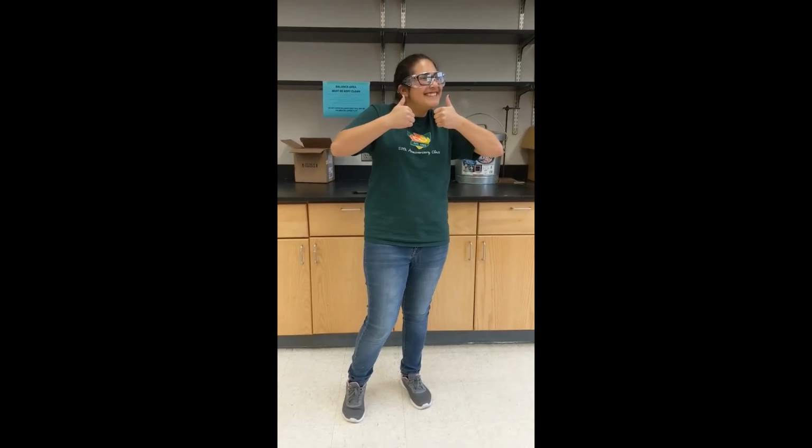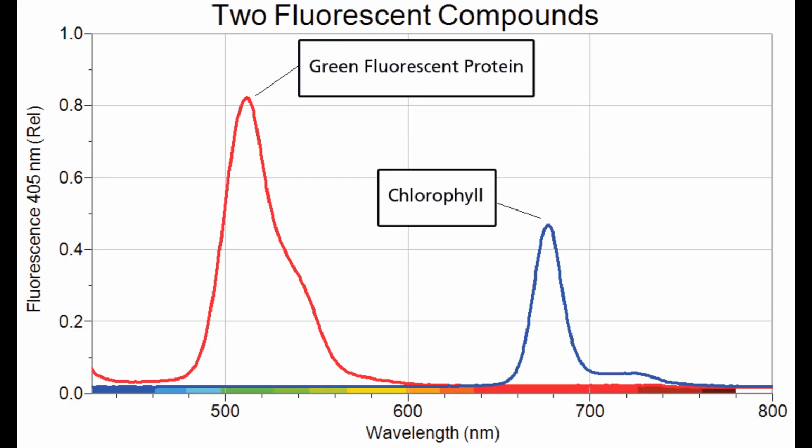As with any good lab, the best place to start is with the proper attire. The spectrophotometer is an important tool used in this lab to help determine the identity of an unknown solution and its concentration, but the data that it produces has to be processed in order to find this information. This is where the Beer-Lambert law is needed.